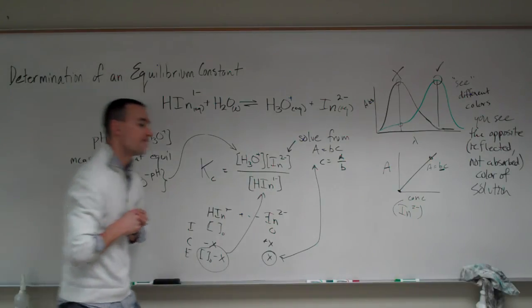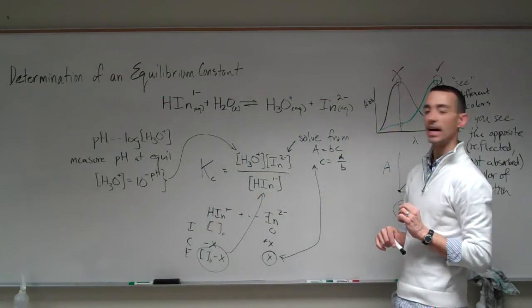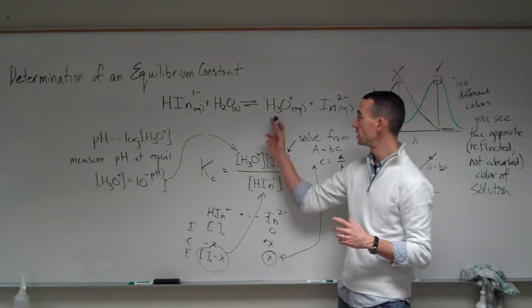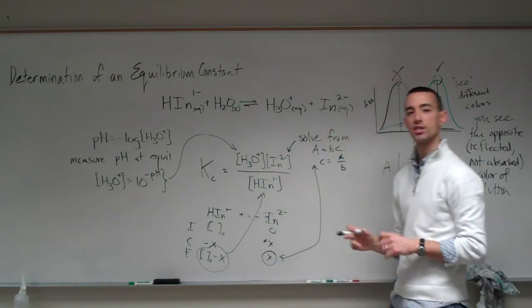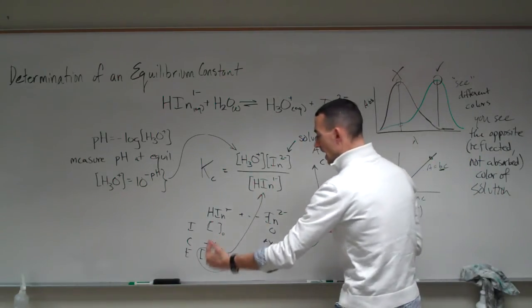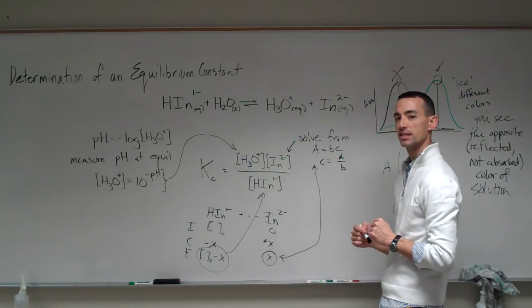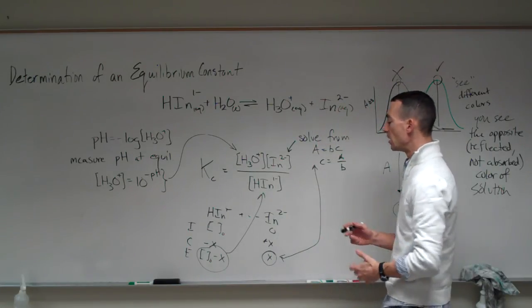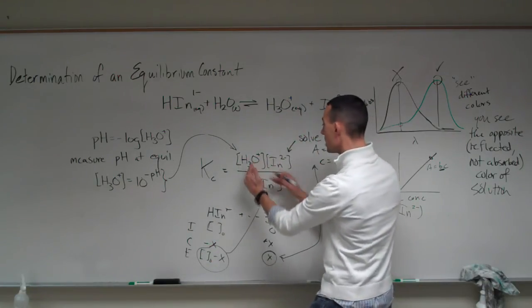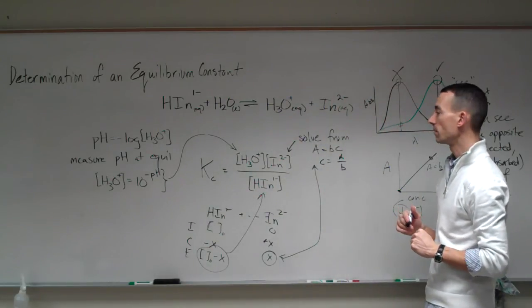Now the way that you'll vary this reaction is that you'll have 3 different pHs that you work at, where you are not beginning with a 0 for H3O+ in the reaction. You're actually going to be supplying a bunch of that, and that's going to alter the amount of reaction that actually occurs. So your X would be very different for your 3 different cases. And what we'd hope is that although X would be different, that would change this, and all 3 numbers would shift to hopefully maintain a constant for our equilibrium constant.